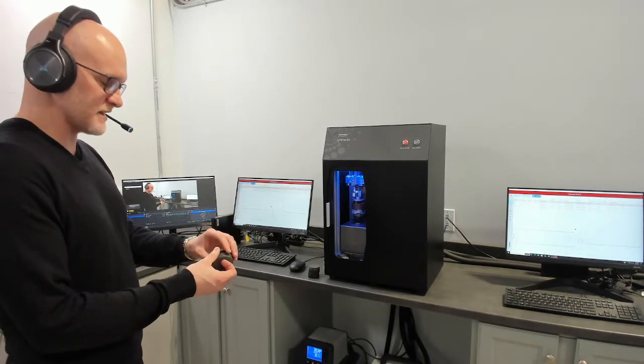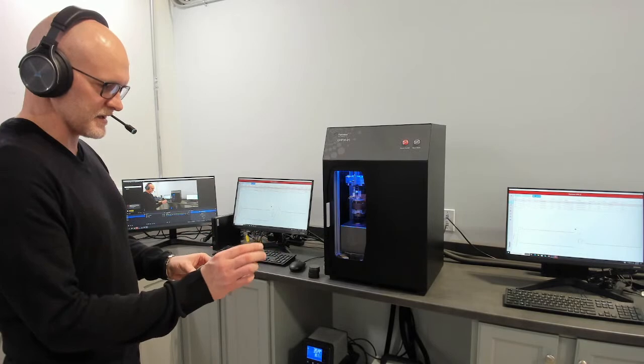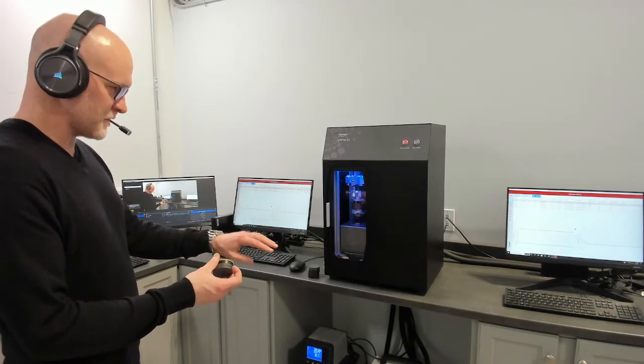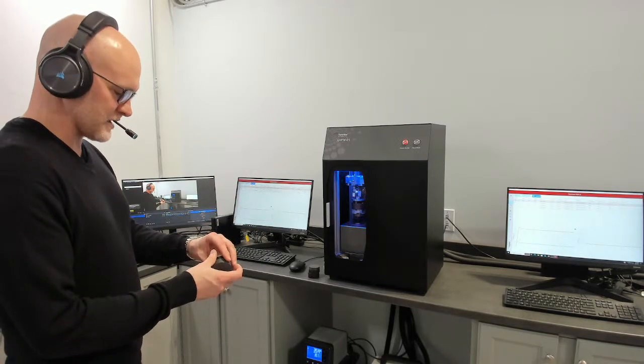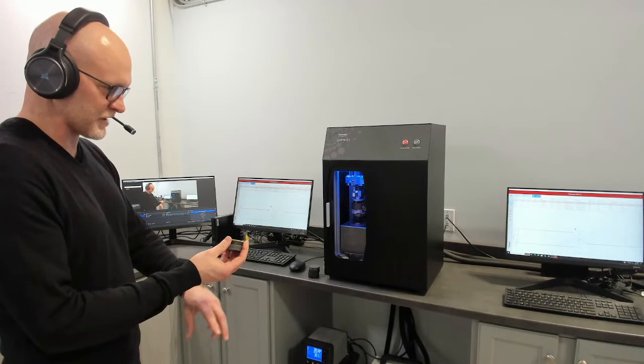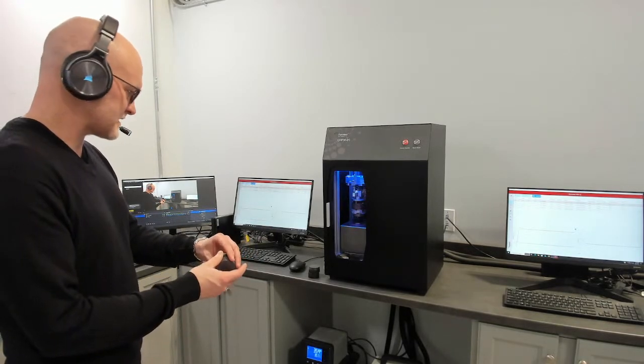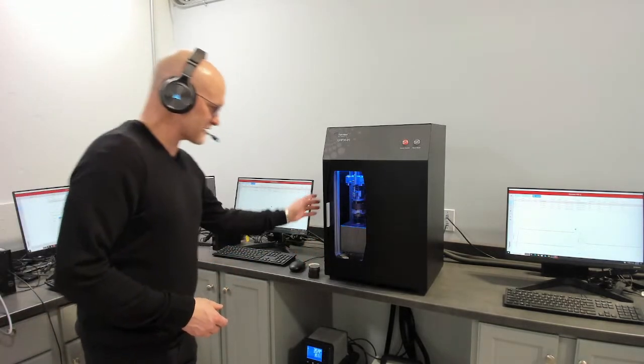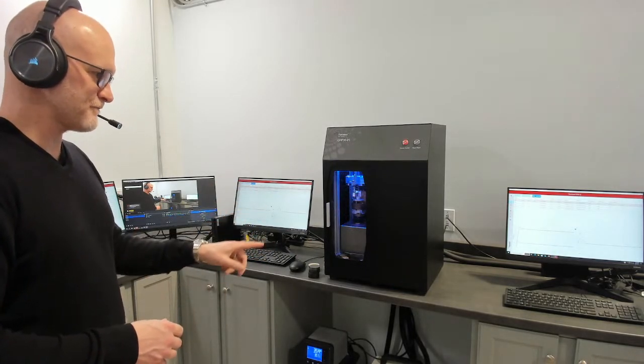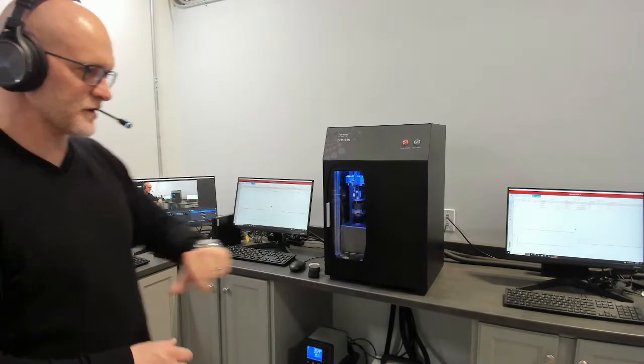The temperature range, this is a steady state device. Typical sample size is two inch with a thickness of thin film up to one inch thick. It is a guarded method so you get a very high confidence one-dimensional heat travel for measuring thermal resistance. The temperature range of this is subambient up to 300 Celsius mean temperature.